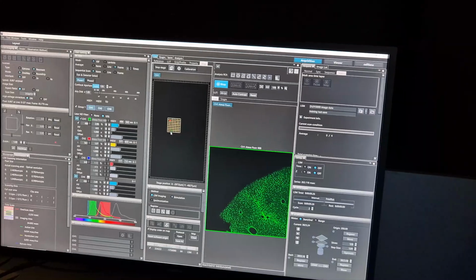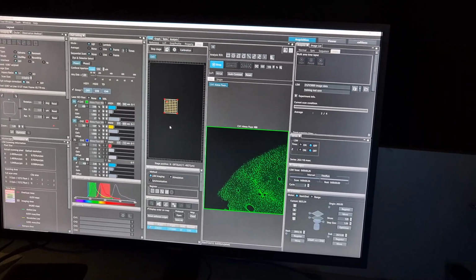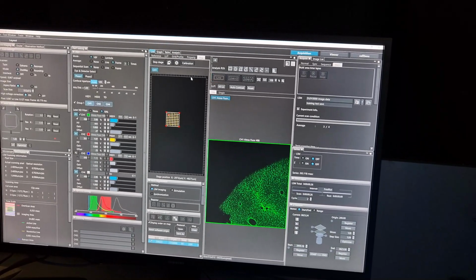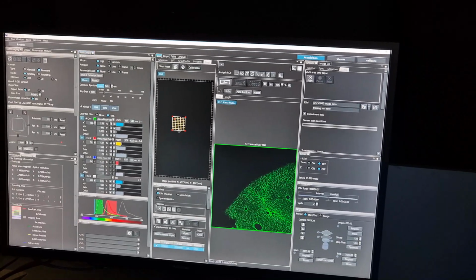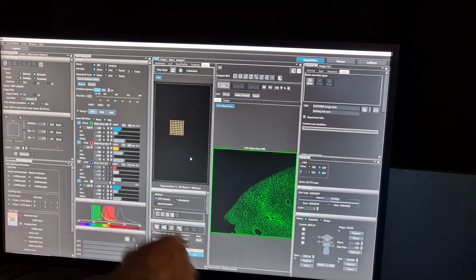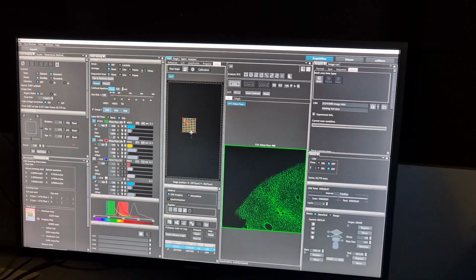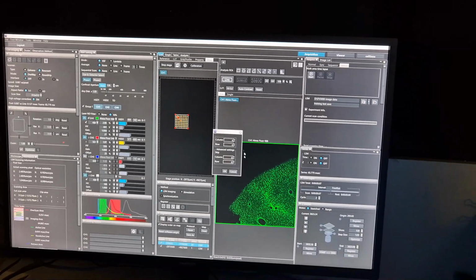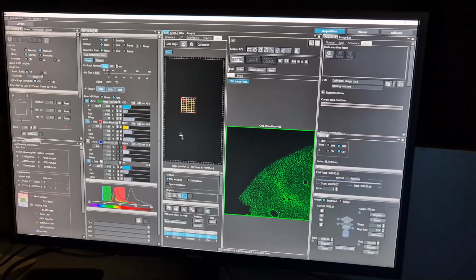Okay, so basically what you're doing is, this is the entire size of my tissue, at least what I want to look at. Yes. And do this Z scanning thing for each of these squares inside the big square. That's correct. Now every time you draw a registered position, some of these are drawing tools, some of these just press a button. So this just registers the position where you click. This one registers a certain number of columns and rows based on the values you put here. This is one that you draw. This is a polygon that you also draw, like so.